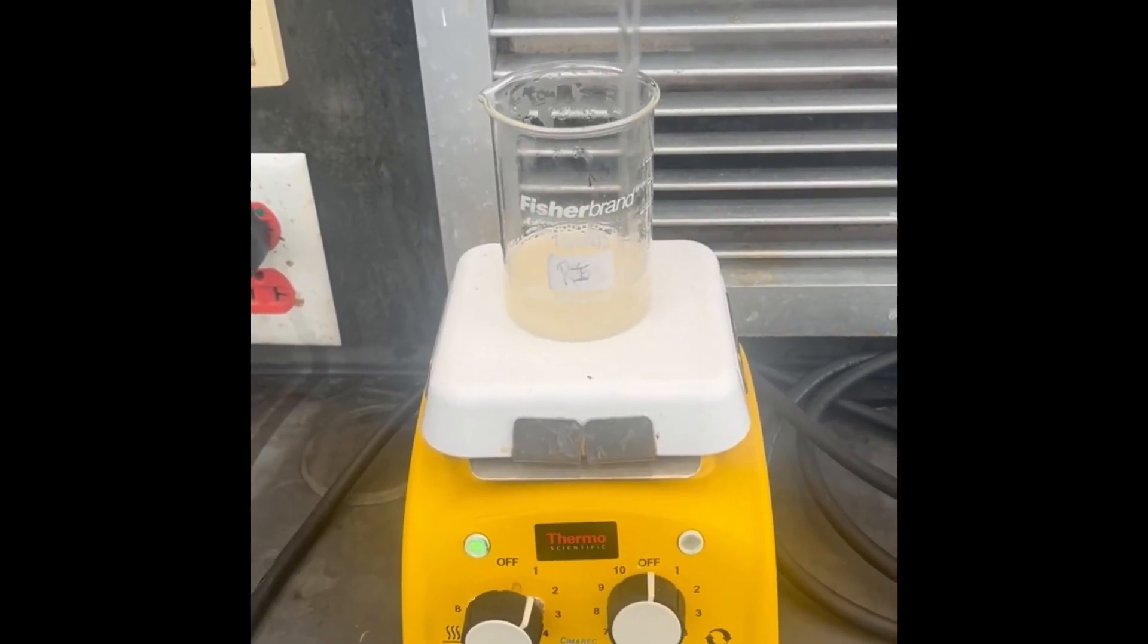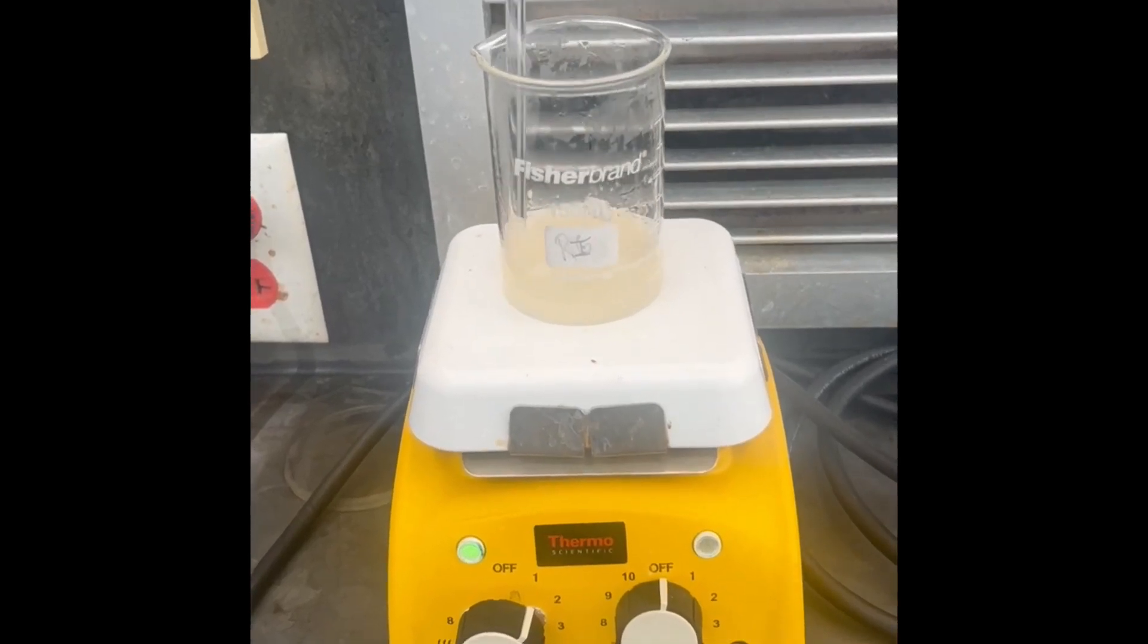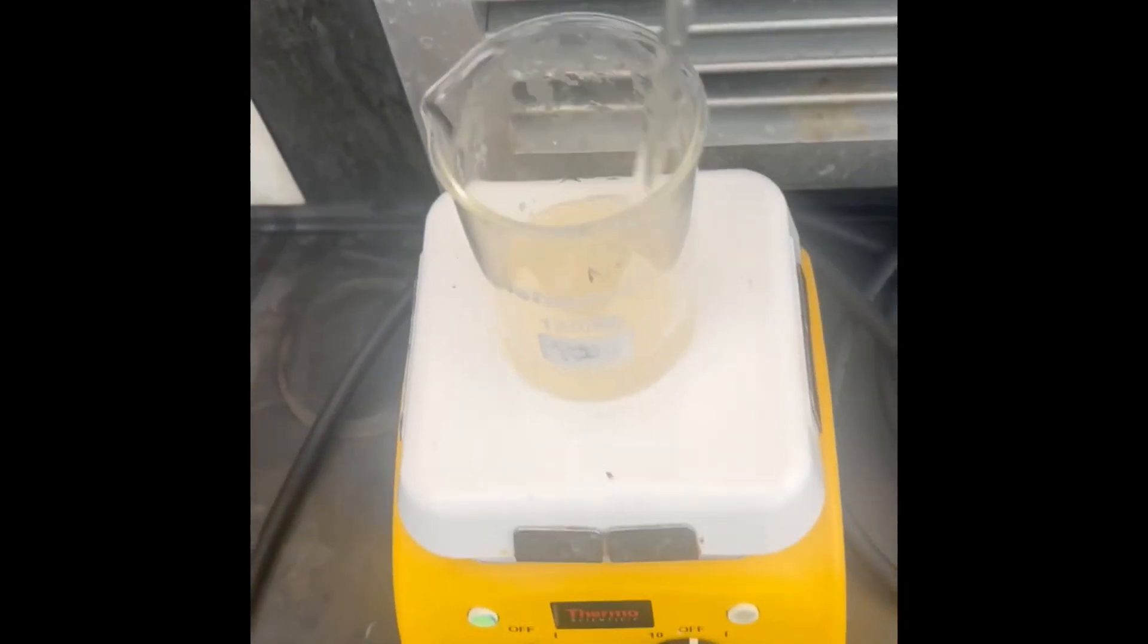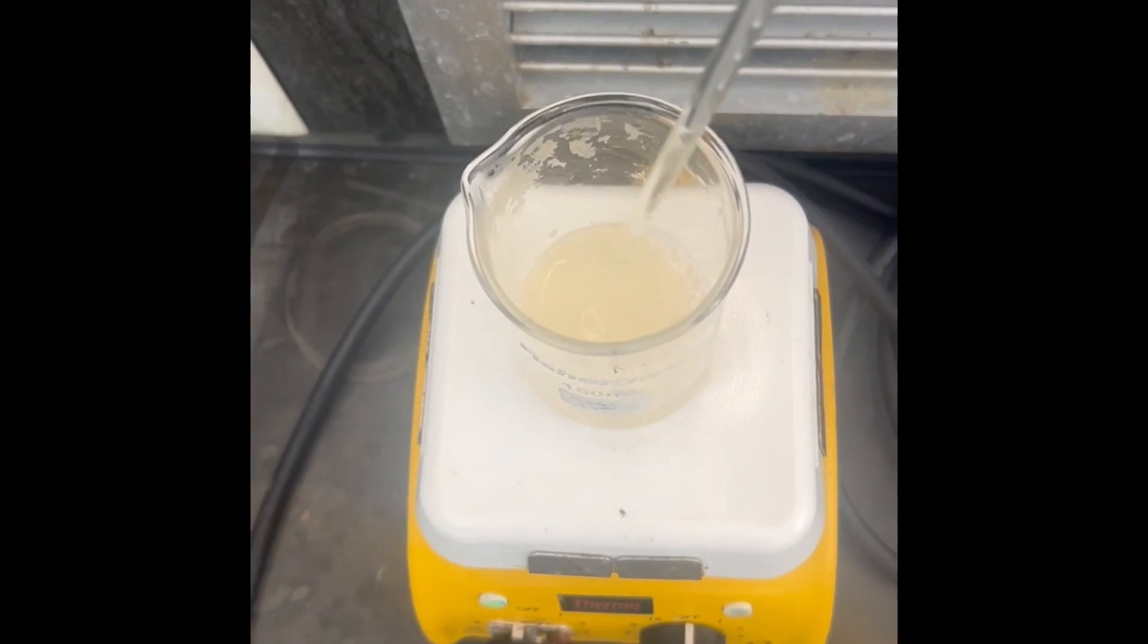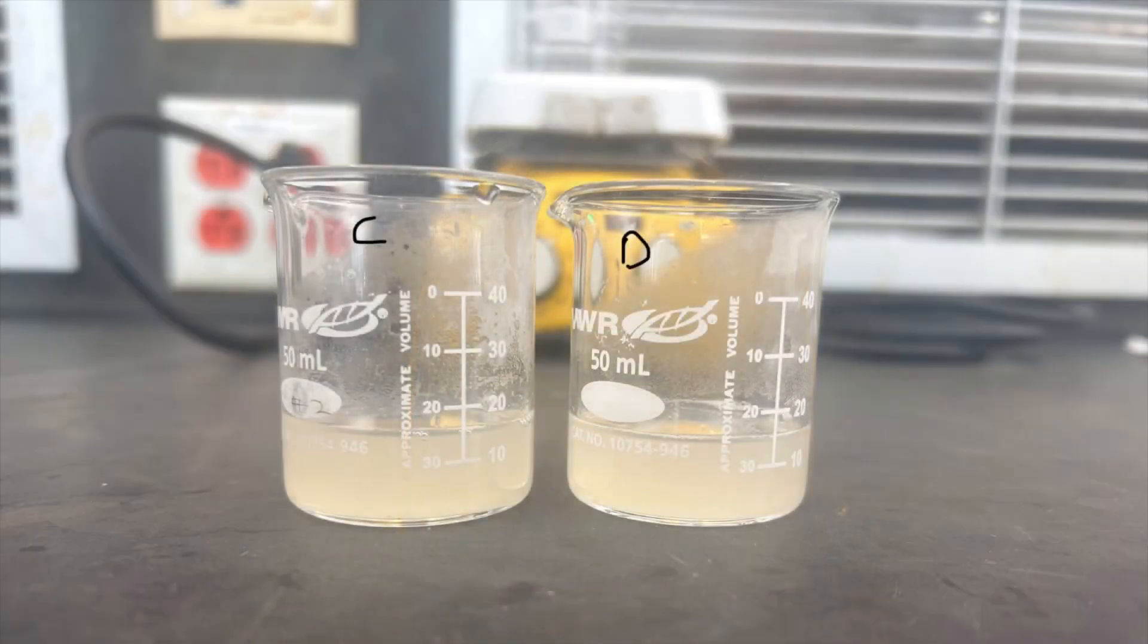Add 30 milliliters of DI water to the mixture and continue to heat and stir until the remains are dissolved. Remove the beaker from the hot plate and separate it into two 50 milliliter beakers. One will be used for Part C and the other for Part D. You have prepared a solution of potassium soap.